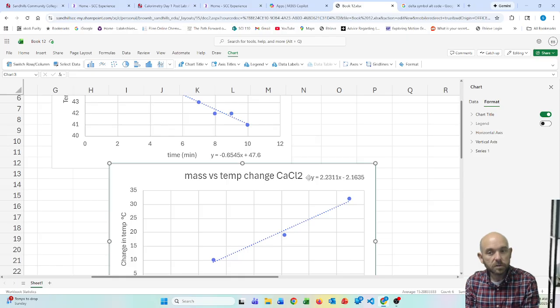We're going to assume that it will be about room temperature coming out of the pipes and the plumbing in the building. It might be a little bit cooler than that, but by the time you get done and everything's equilibrated, it will probably be room temperature anyways. So we're going to start at room temperature, and we're going to try to reach 70 degrees Celsius in our hot pack. And we'll be starting at room temperature, and we're trying to reach 5 degrees Celsius in our cold pack.